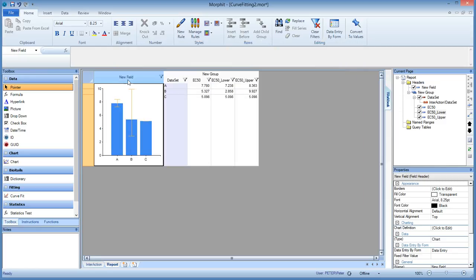And this is quite nice, because now you see that the spread in the B series is large, whereas in the C it's almost zero, and here it's quite small.